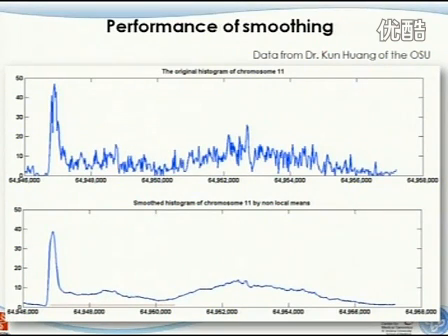What can cause that is, once you do the measurement, your equipment may receive some kind of random noise from somewhere, and on top of that, if your signal is small enough and the noise is big enough, they cause this type of thing. For this scenario, the noise can be caused by, for example, a sampling issue.